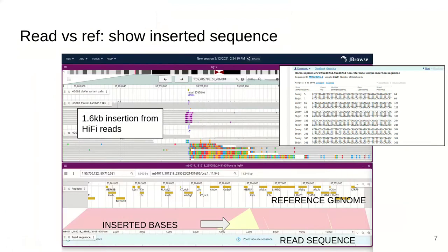We also have a special feature for alignment tracks called the read versus reference view. These are hi-fi reads, and the purple indicator shows a 1.6 KB insertion. We can right-click any one of those reads and create a read versus reference view which shows the inserted bases. I can click and drag to get the sequence of those inserted bases and, for example, BLAST it, which gives me a match.